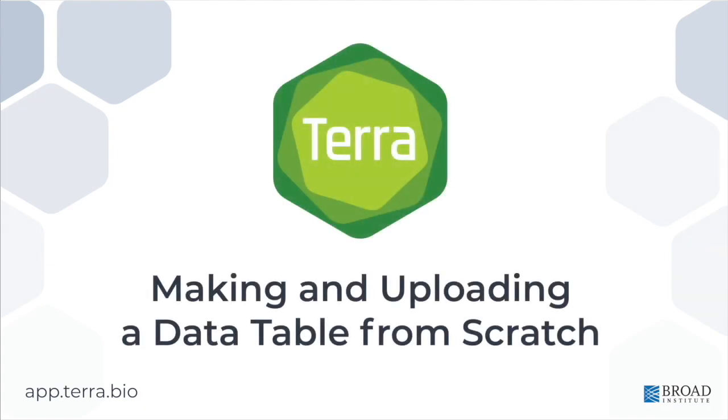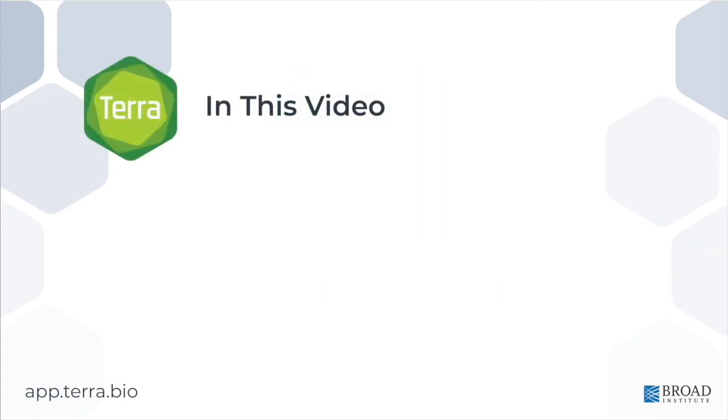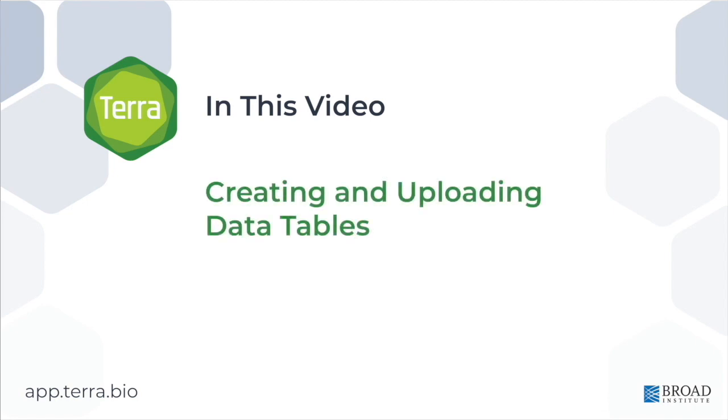Hi, this is Anton from the Terra team. In this video, I'm going to guide you through a simple example of creating a data table from scratch and uploading it to the data section of your workspace.